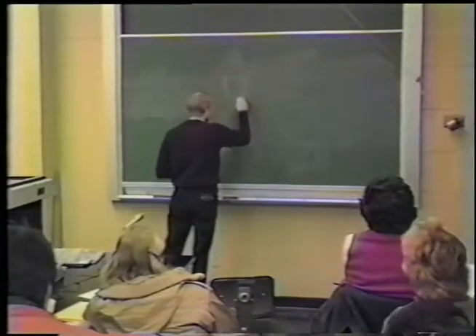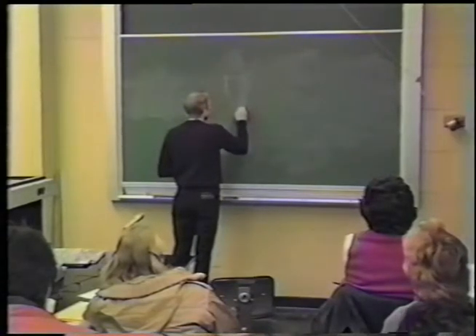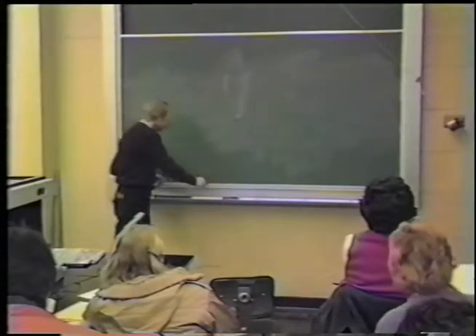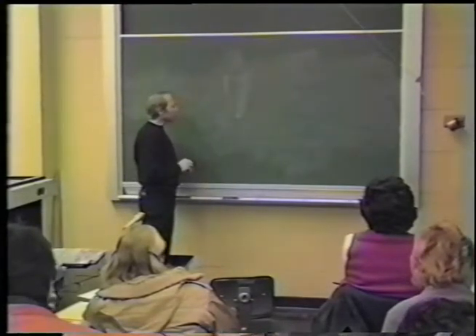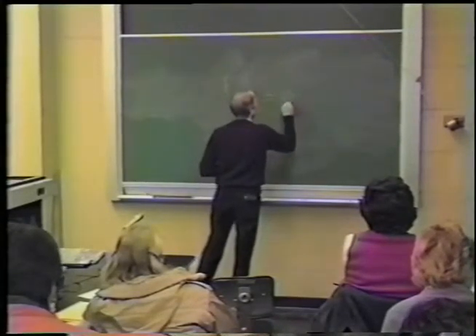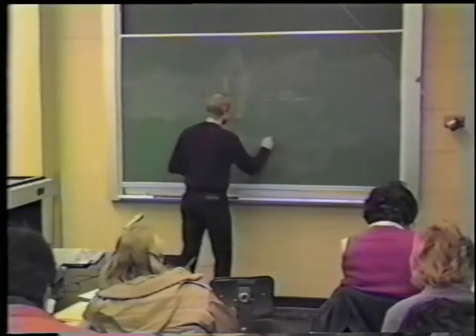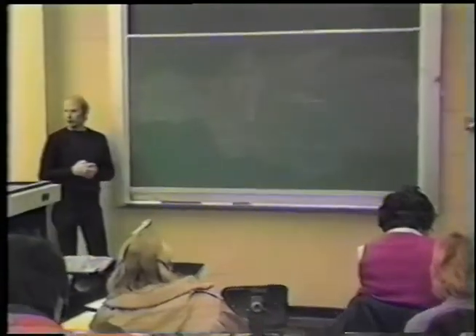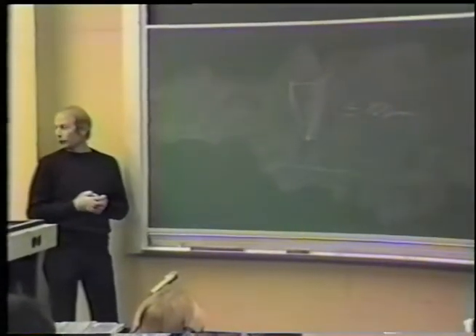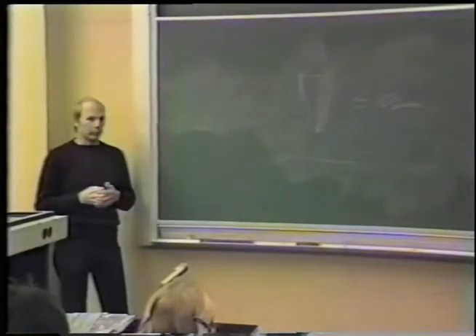The Venturi effect pulls the sample into the rush of gas and vaporizes it, converts it to very tiny droplets. And you then spray these very tiny droplets. The droplets are less than or equal to 10 microns in diameter. You spray these droplets into liquid propane at a fairly high velocity. You generally use 4 to 10 atmospheres pressure. This is just a commercial airbrush. Put your sample in there and spray it into the liquid propane.